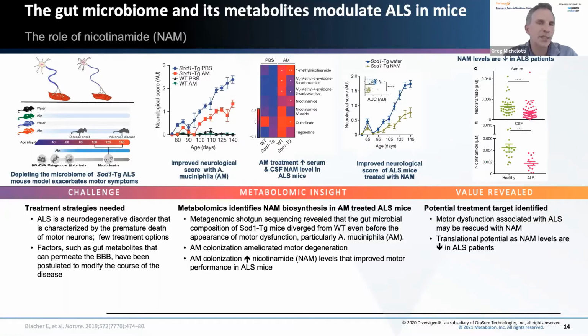Where metabolomics is particularly useful is that it provides the functional readouts of changes in the metagenomic compositional profiles. Because the investigators understood what strains were involved, they could study these mice inoculated with different strains and look at the differences in their metabolic outputs in the circulation of the mice. So changes in gut profiles and readouts in the circulation are what investigators are looking at in terms of the metabolomic profiles that we performed at Metabolon.